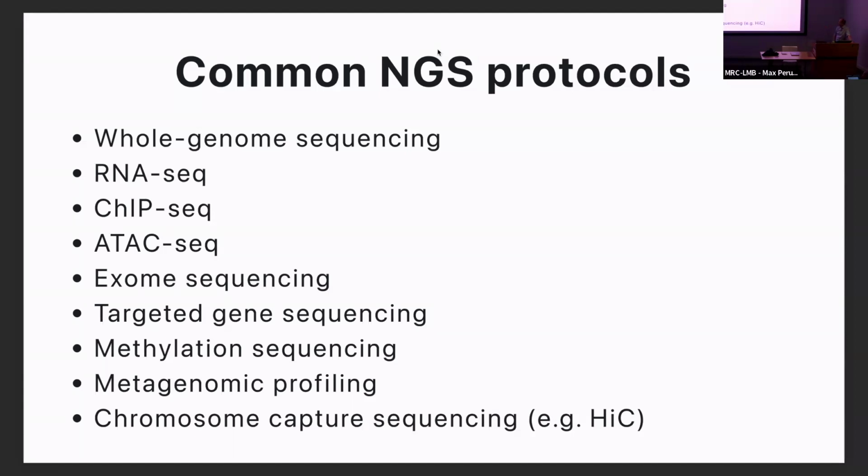You can look within chromatin at regions of accessibility or regions which are more closed using ATAC-seq. And then you can perform targeted sequencing using things like exome sequencing or targeted gene sequencing. And even in the field of epigenetics, it's been useful where you can, for example, use techniques like bisulfite-seq, where you can identify the methylation profiles of CpG islands in the genome.